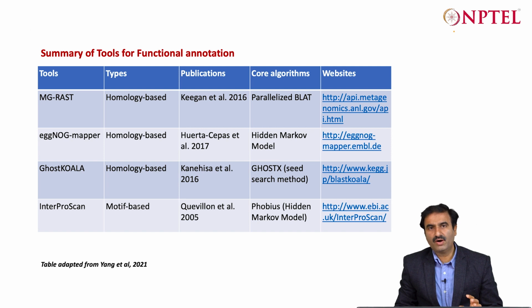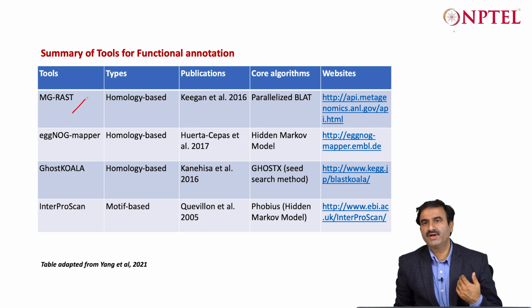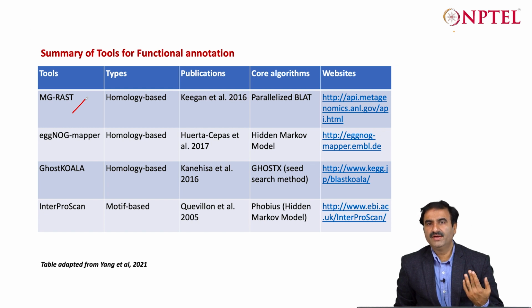One of the common pipelines to do metagenomic analysis is MG-RAST, which allows you to upload your entire metagenome. It will give you the option to create a login. You can compare against the other metagenomes which are available there. Then you can let it know what all you want to be analyzed.